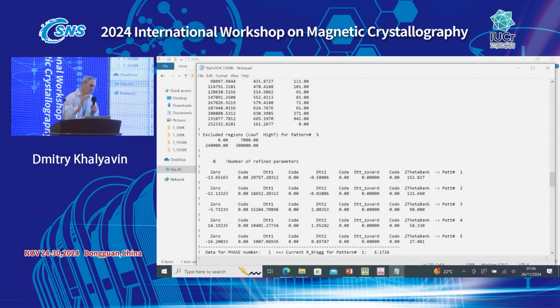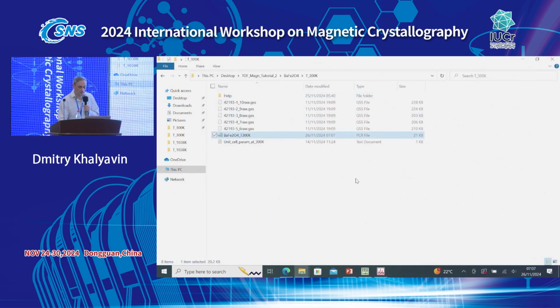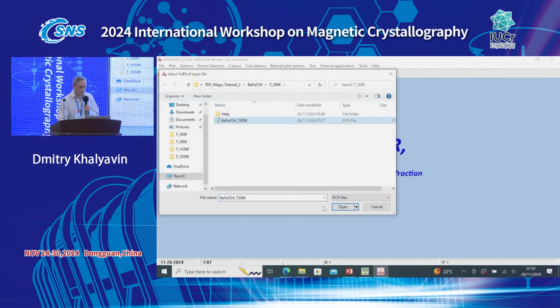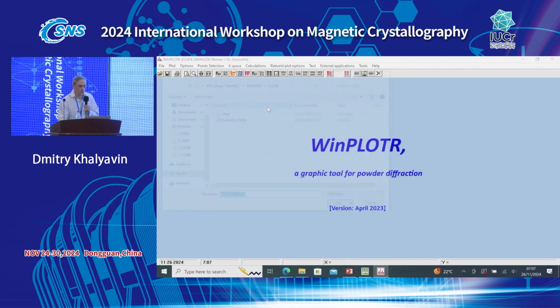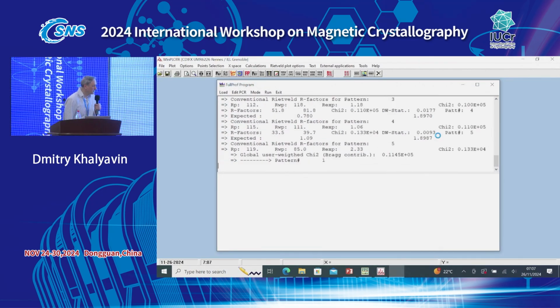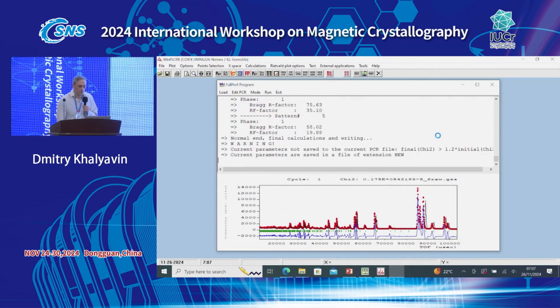Because, as I said, there is no way which can work for all situations. So our next step will depend on where we are. So we need to see where we are. Let's just run it like that and see what is best to do next. So we just run again. We go to WinPlotter, FullProf, run, and see. It will do just one iteration and stop.